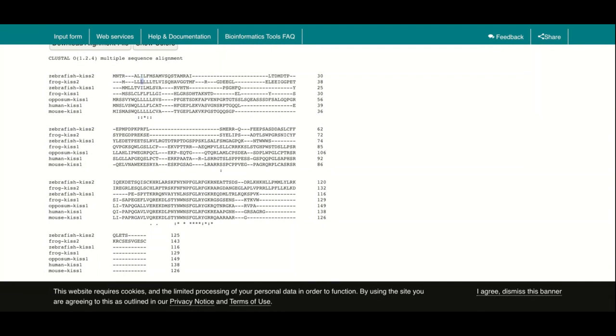Isoleucine and leucine sound pretty similar, and actually they are. You look at the table and you will see isoleucine, leucine, and then phenylalanine, that's the F. You don't have to memorize that. You can just type amino acids table, and you will see the names. They have three-letter names and one-letter names for the amino acids. But what I want you to figure out is what the two dots mean. And it has to do with how much conservation there was.